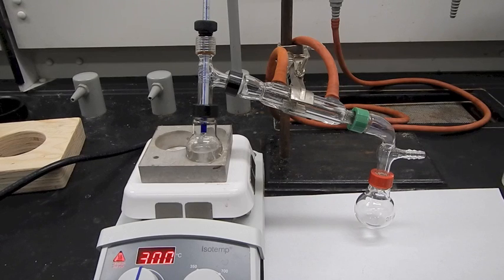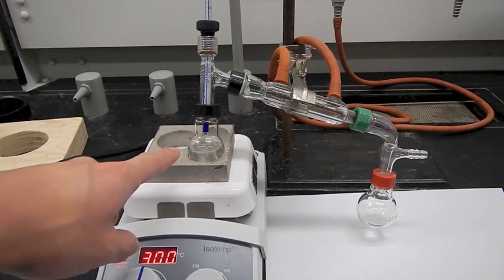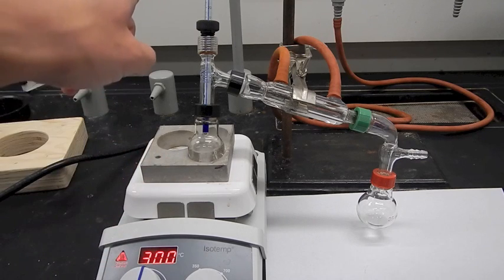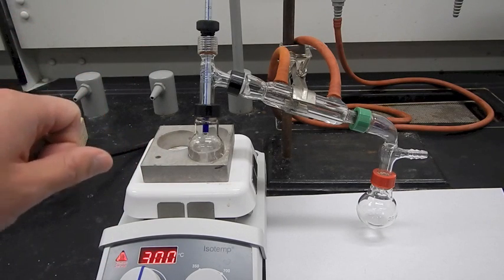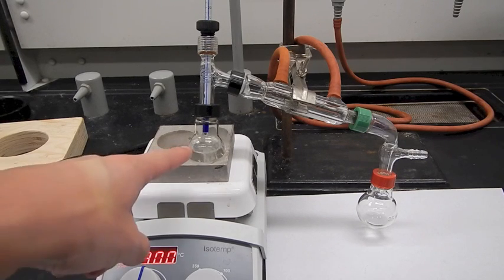So it's been about 5 or 10 minutes and I've got a nice rolling boil in my distillation flask. My thermometer is at about 81 degrees and I'm getting a nice even drip of my pure product coming out into my collection flasks. So this is exactly what I'm looking for, and I'll just continue to distill until this flask is nearly empty.